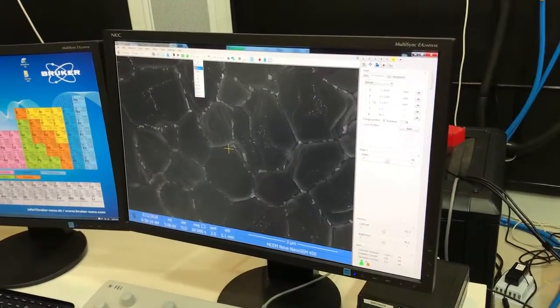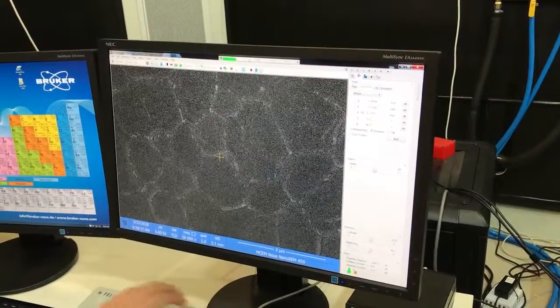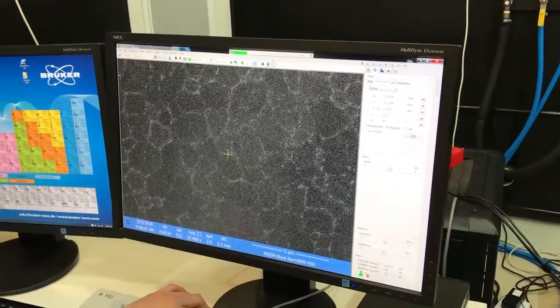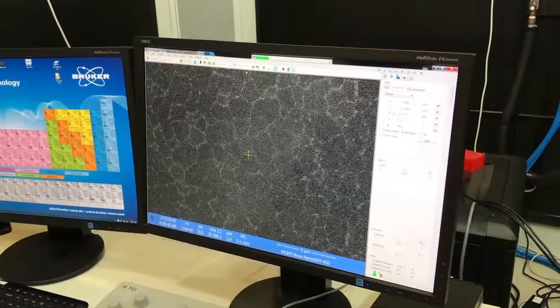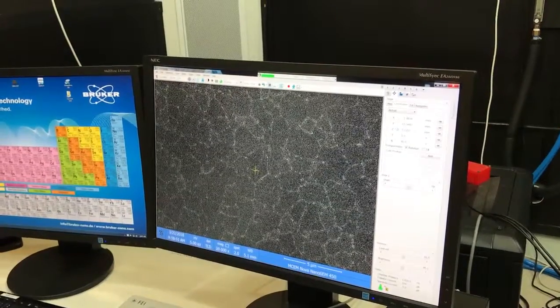We can maybe go for another lower magnification. Wow, that's lovely. I'm just doing 20 microseconds.